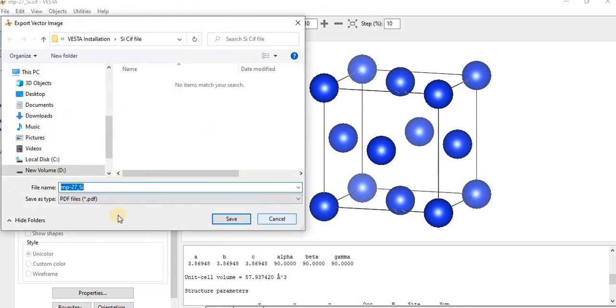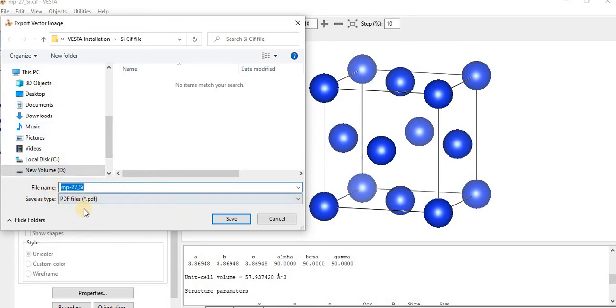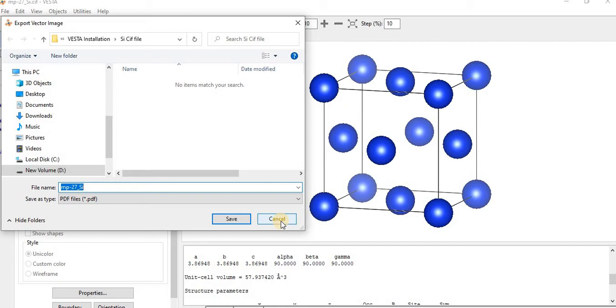If you take it in vector image, this will be generated as a PDF, so then you have to crop this image from the PDF. I don't want that PDF file, I want the JPG or PNG file.